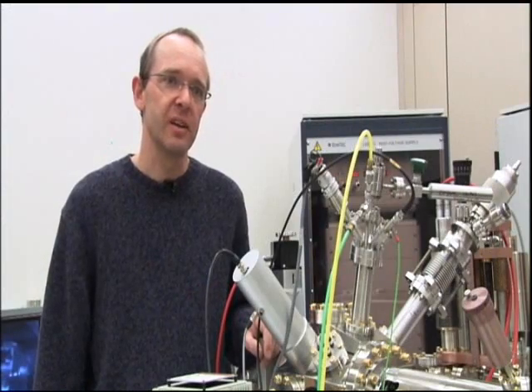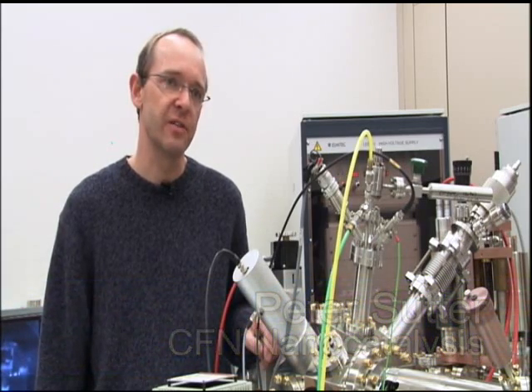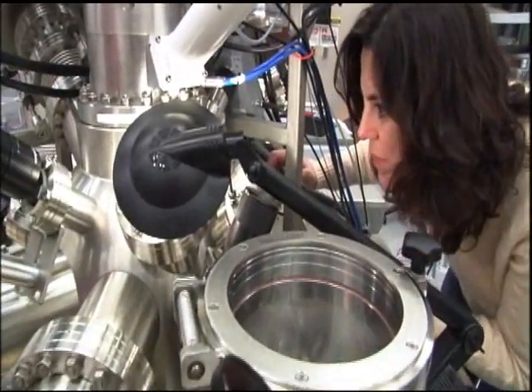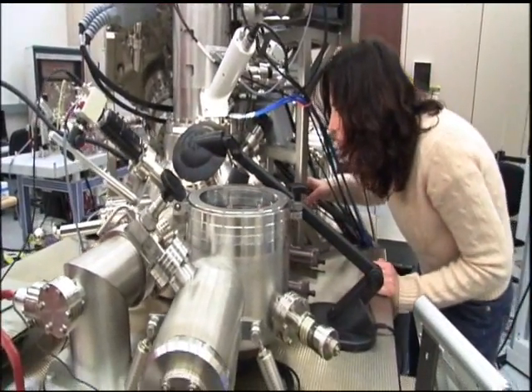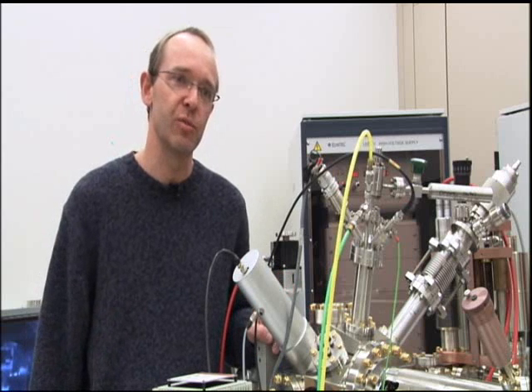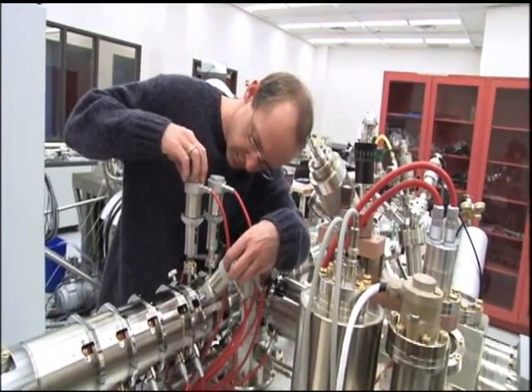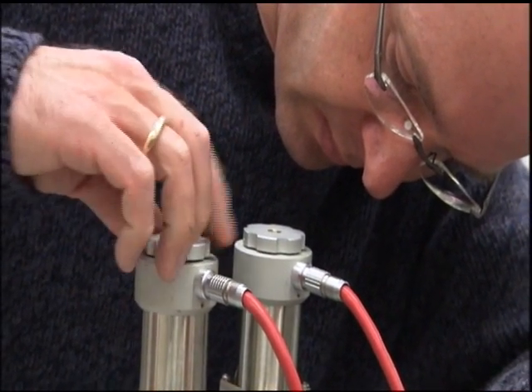So in the CFN we have dual roles as staff scientists. One of our roles is to do internal science, push the science forward on our own, but a very important mainstay of our activities in the Center for Functional Nanomaterials is working with external users. Our facilities are quite unique. They include machines that one might not find in a university lab, but they in particular combine machines that are very powerful on their own, but even more powerful when combined under the same roof. So a user might find that he uses a machine that he applied for, but then has the opportunity to come and use a different machine that may complement what he has already learned with the first technique and make the combination of the two much more powerful than anticipated.